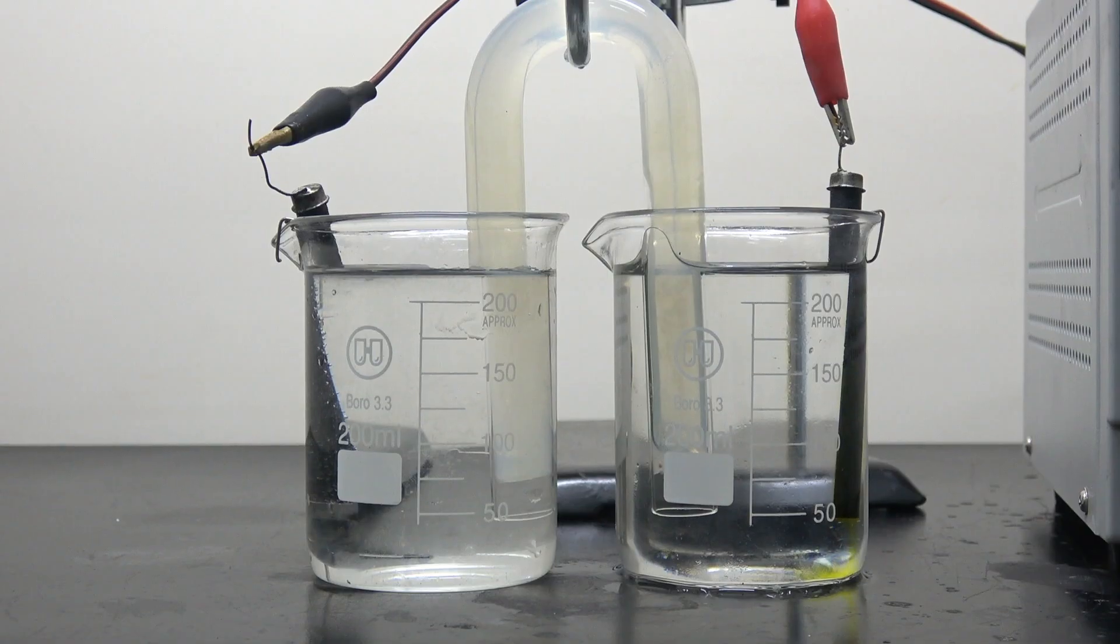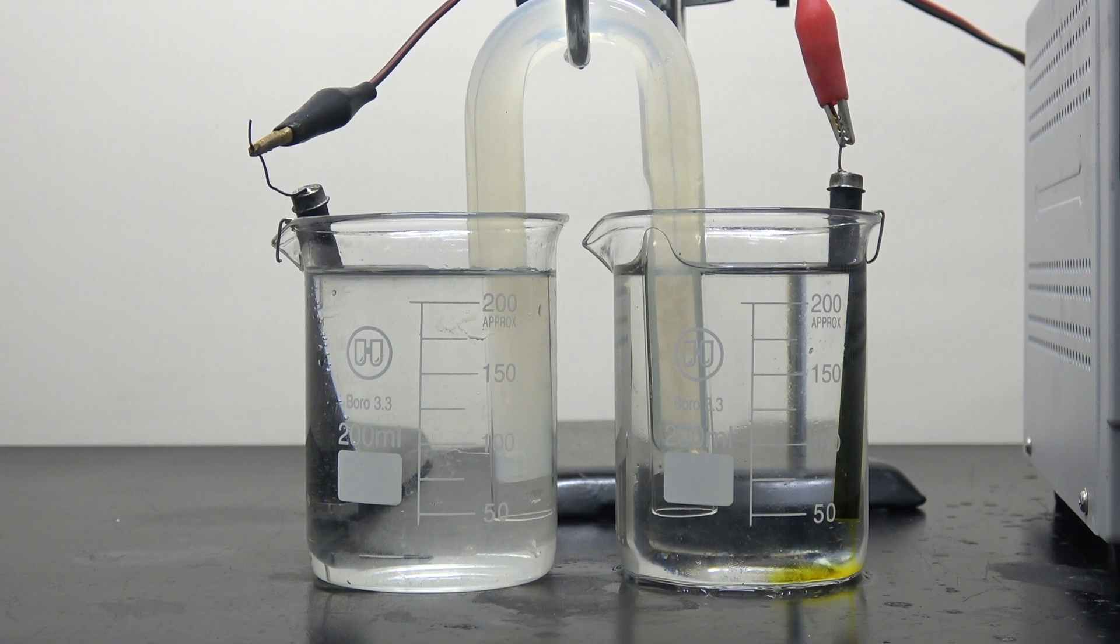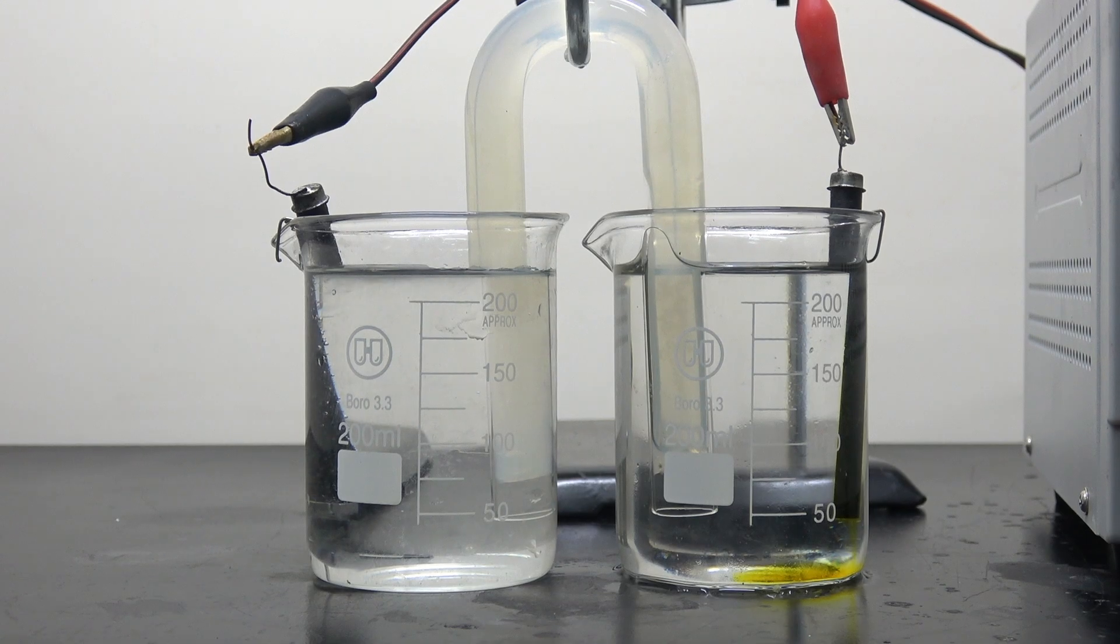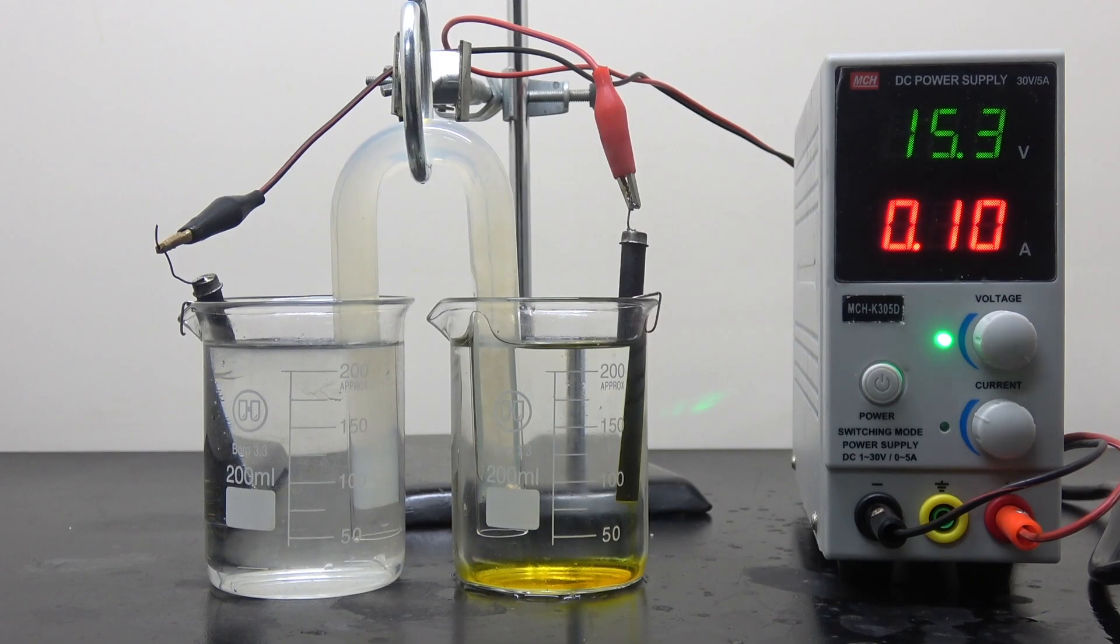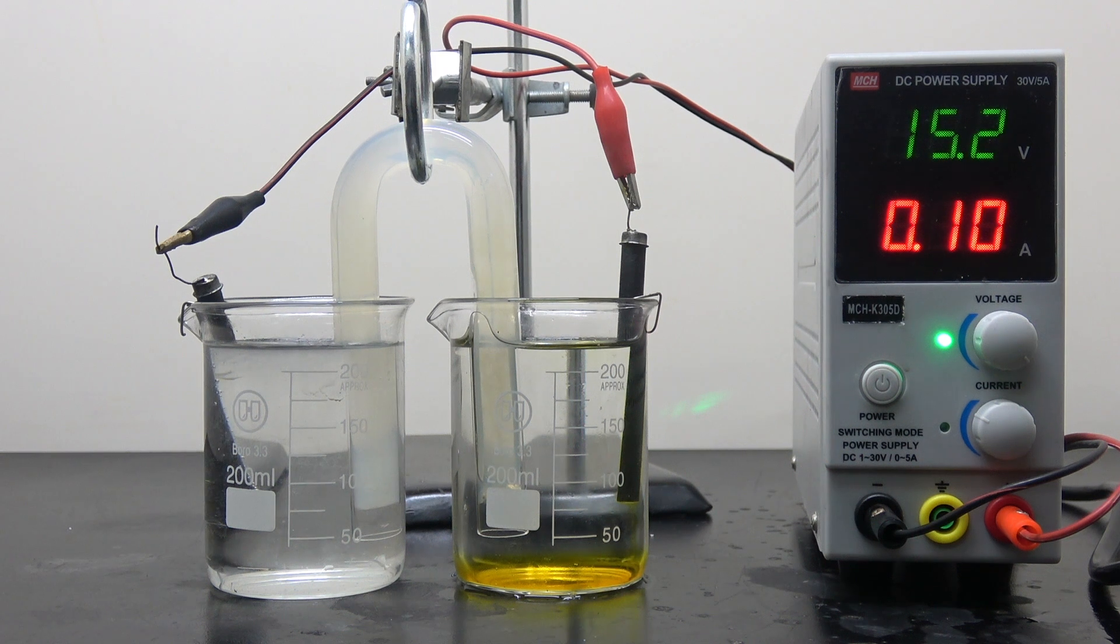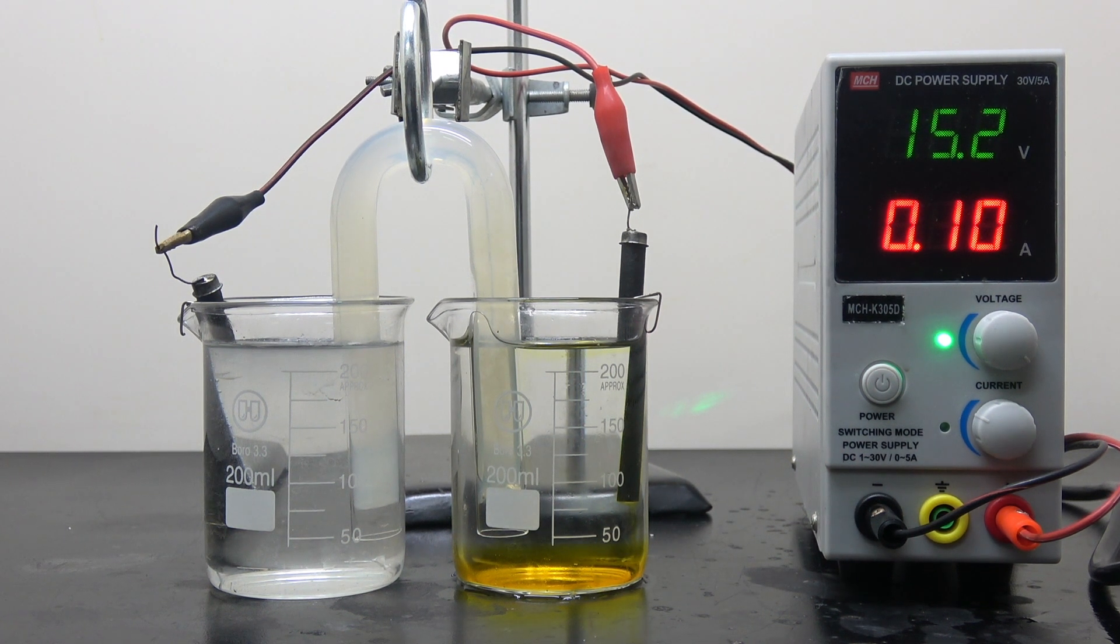As soon as I turn on the power, immediately we can see the brownish bromine is produced at the anode. It's important to keep the current relatively low, as the graphite electrodes will disintegrate over time, the rate of which increases exponentially when the current goes up.